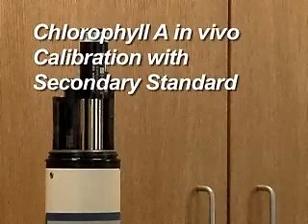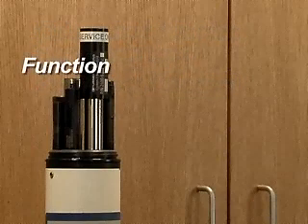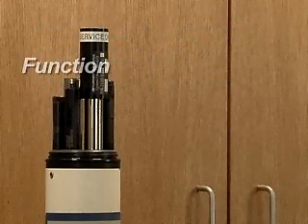Chlorophyll A in vivo, calibration with secondary standard. The chlorophyll A fluorometer emits blue light into the water sample, which is absorbed by the chlorophyll A in the algae. The chlorophyll A fluoresces red light in return, which is detected by the sensor.